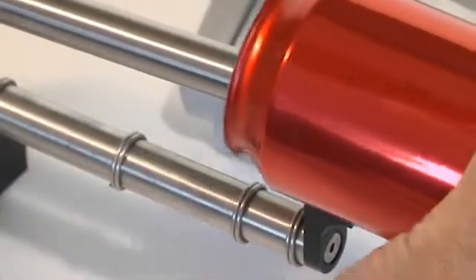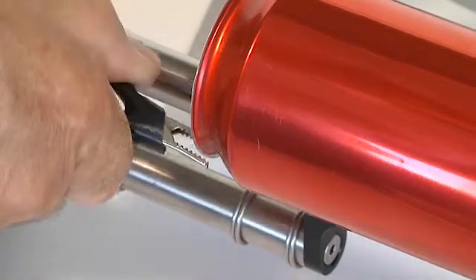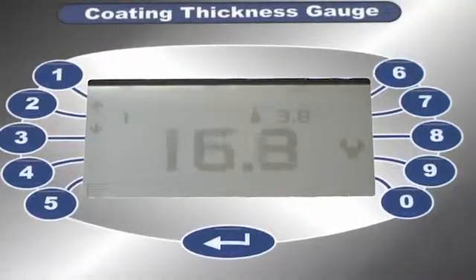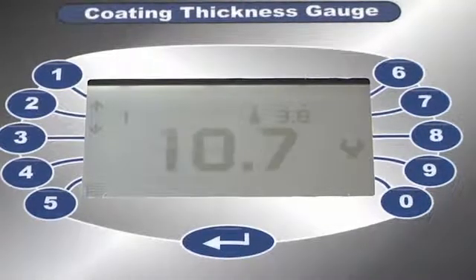Sencon's gauge has a 1% linearity across its full range and works equally well with steel or aluminium cans and sheets, provided that there's no metal content in the coating.